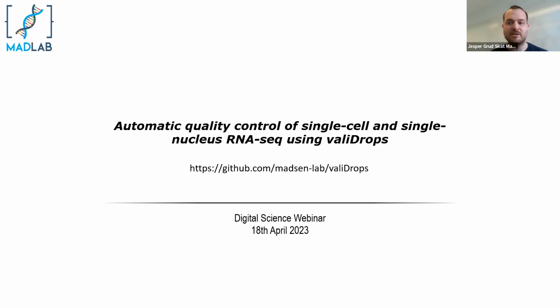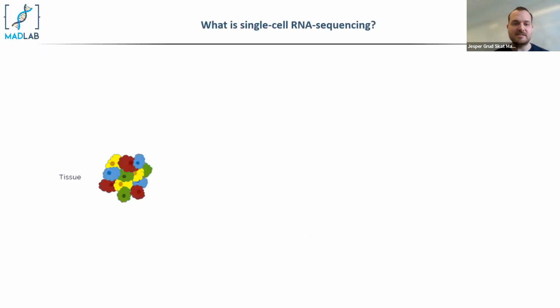Since I was informed that the audience is a mixture of bioinformaticians or computer data science people and also clinicians, I brought one slide about single cell RNA sequencing. By now, it's an older technology. It has existed for quite a few years now, but it's being really widely adopted and put into work in clinical settings and other settings.